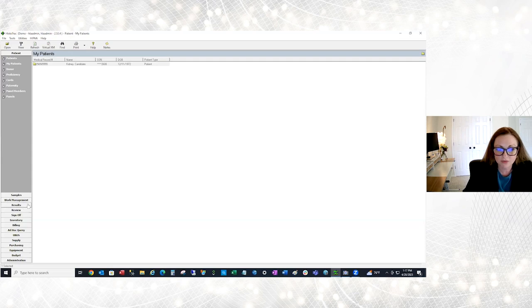When you're finished, after you've done all of this, you want to result it. Maybe a supervisor needs to review it, and somebody would sign it off. At the end of testing come some ancillary features here. So you may need to put the sample into storage, or bill it, or query the data back.